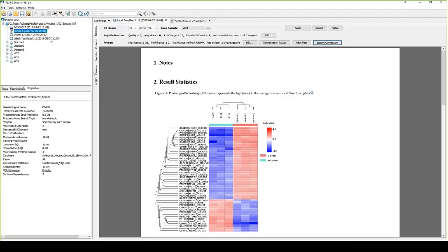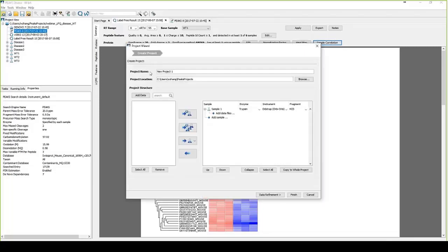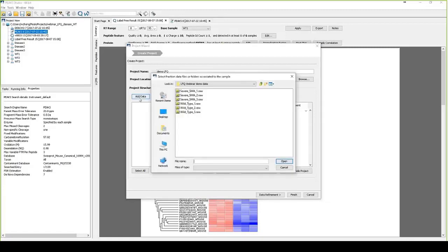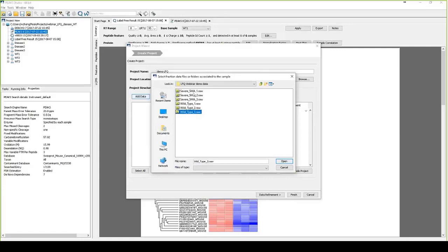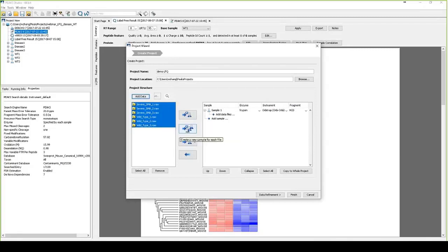Okay, so I will start with how to create a new project for an LFQ dataset. So what you will need to do is to click the first button on the toolbox row to create a new project. So now I can call this project demo-LFQ. And then under the project structure, you can click the add data to find where your raw data are. So for example, I still use the dataset that I used in my slides, which contains three disease samples and three wild-type samples here. So I select all of these samples and then click Open.